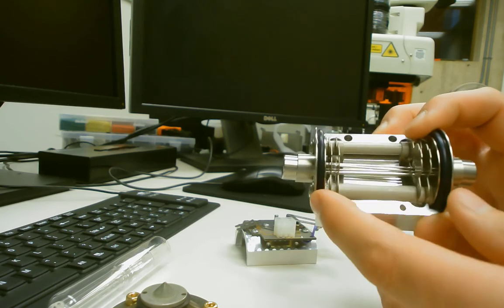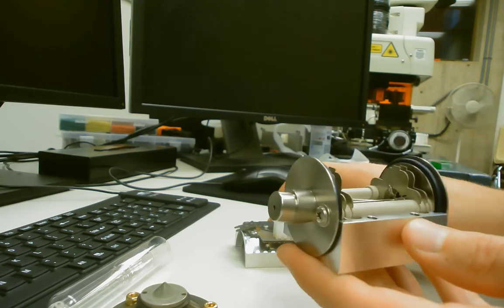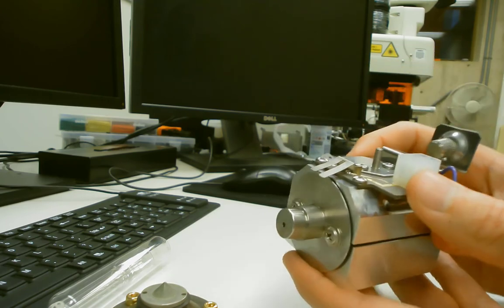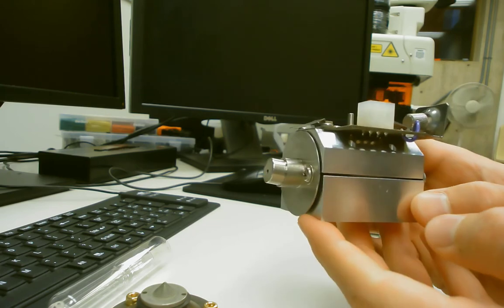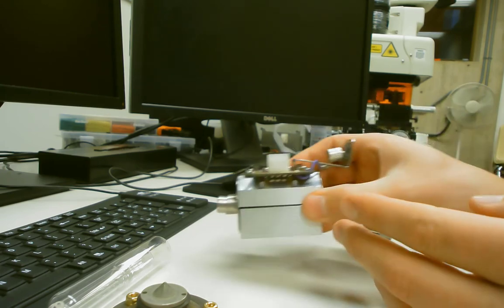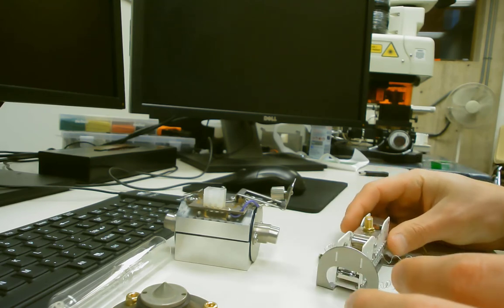This whole cell is sealed, so you can see there are O-rings on the ends here. This is what we pump with different gases, either helium or hydrogen, depending on if we're going to do collision mode or reaction mode. Okay. And then it goes to the quadrupole, which we don't have one of to show.